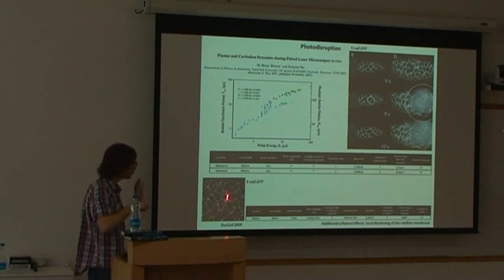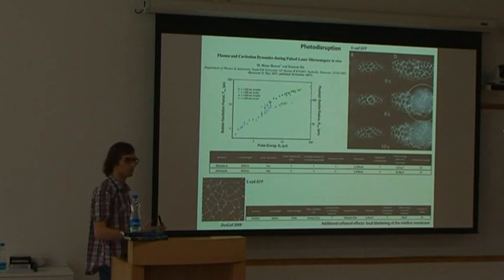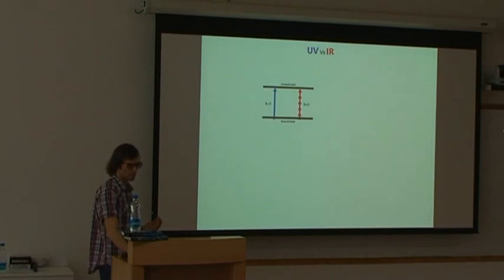I don't want to go too much into this paper. It's just to send a message out. When you have a paper and they are using laser dissection, you have to be critical. So what are the main parameters you have to look at to judge the work? Okay, now there are always many people that ask me, is UV better, is infrared better? It's not that one is better than the other.